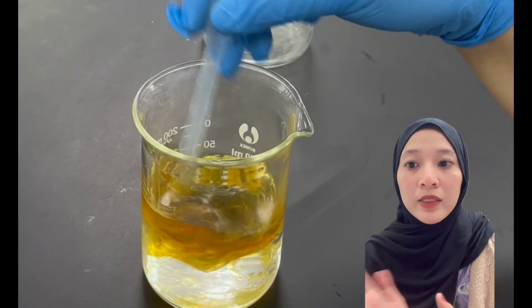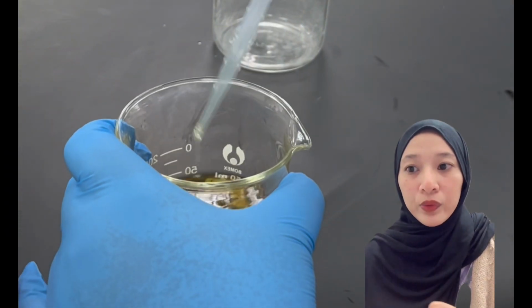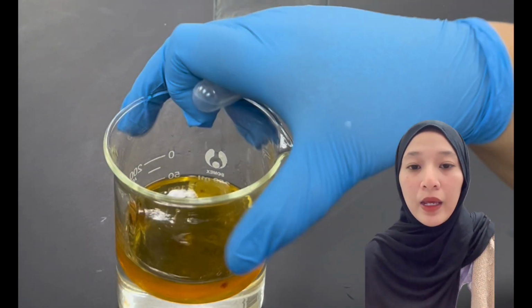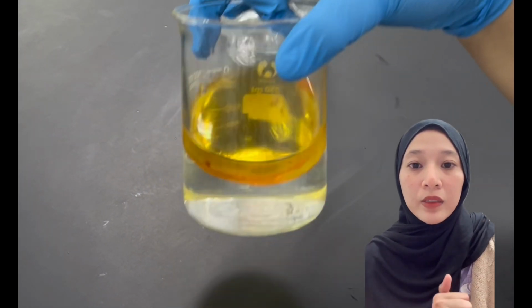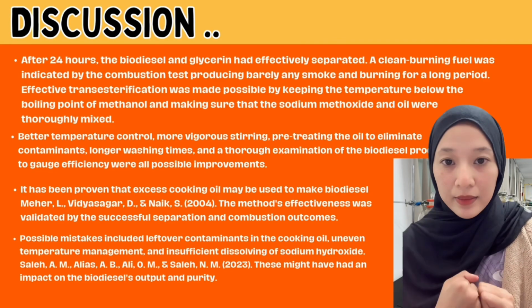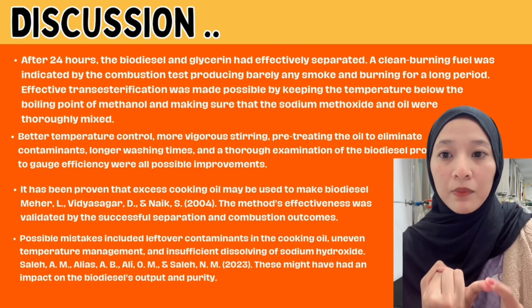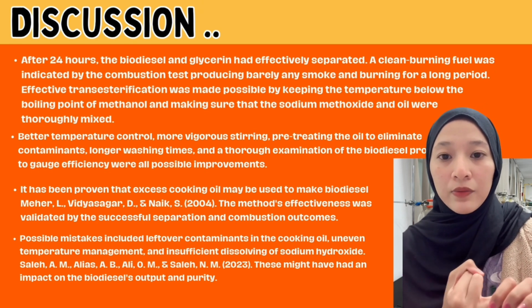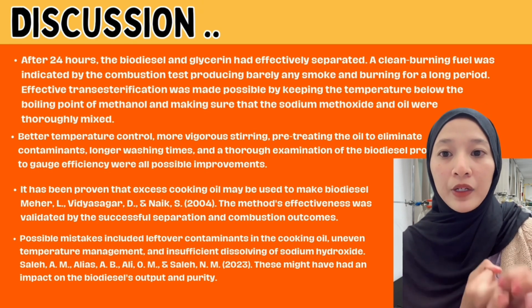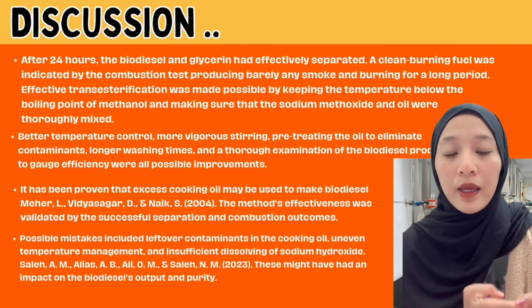Furthermore, extending the washing process would have helped to remove more residual methanol and other contaminants that can lead to a cleaner burn for the combustion test. And lastly, possible mistakes such as leftover contaminants in the cooking oil, uneven temperature management, and insufficient dissolving of sodium hydroxide can have an impact on the biodiesel output and purity.